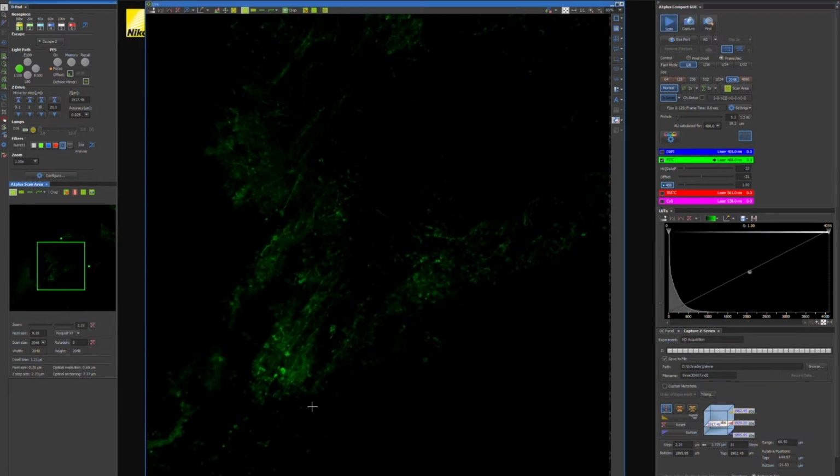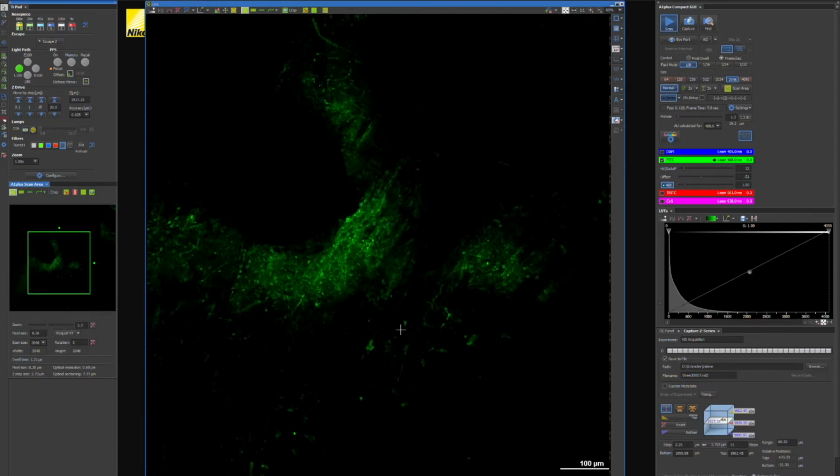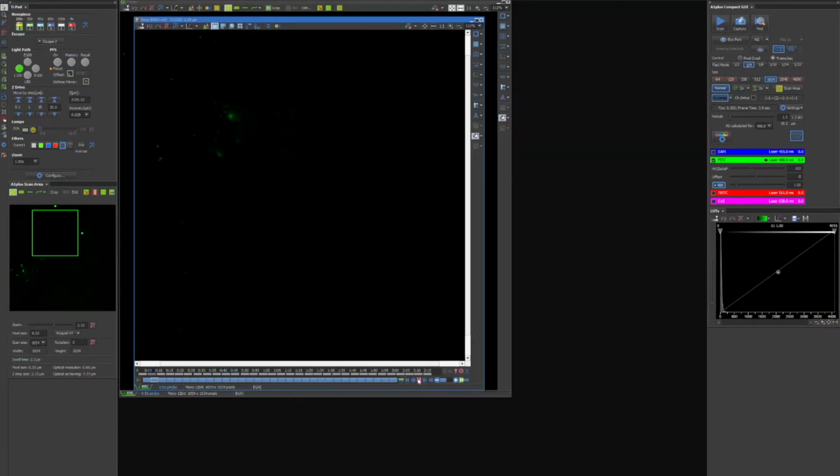You can see a little bit of directionality, indicating that it did stain some neurons, but again, they just didn't go very far. I know it wasn't because I had too little dye, since I had really overdone it on the dye, so it seems to me like I have to let the brain sit for pretty much as long as I can before it starts to grow mold.